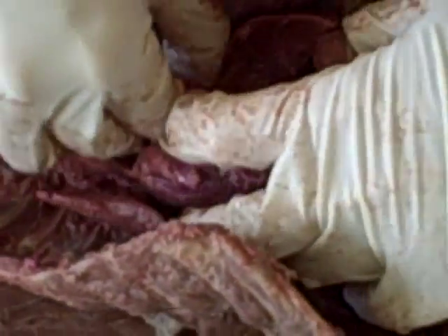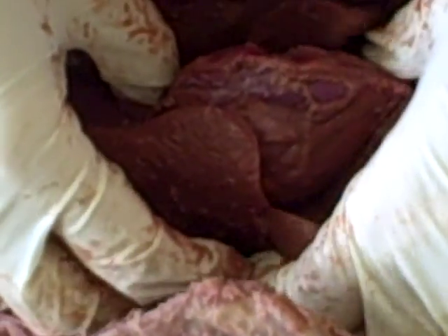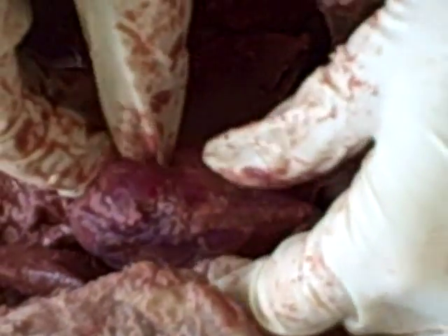Now on the other side, they're down on the side of the animal. Here are the other lobes of this organ. So it's a large organ covering up a central organ, and it's lobed. The next one is the central organ.